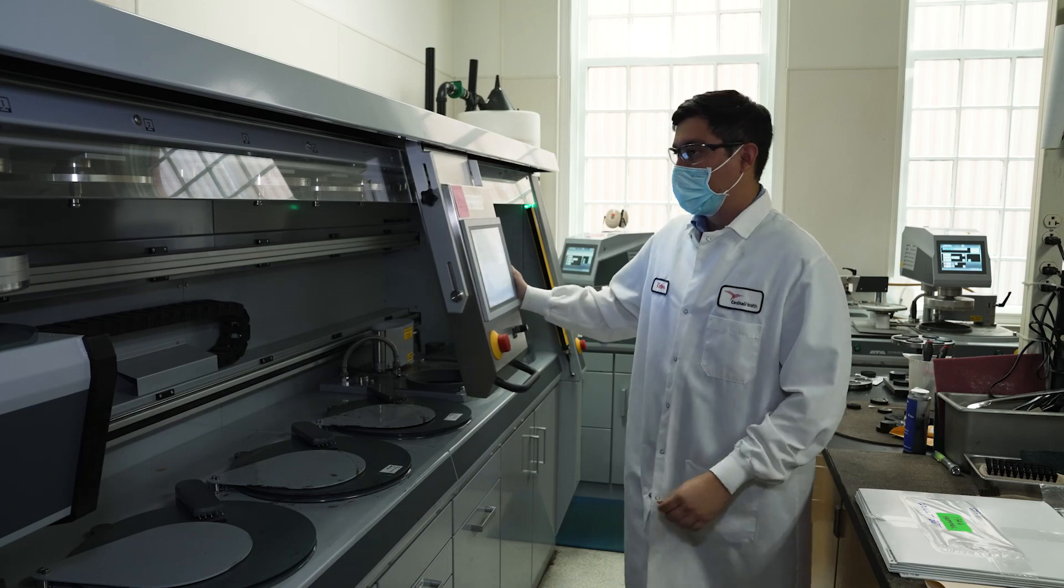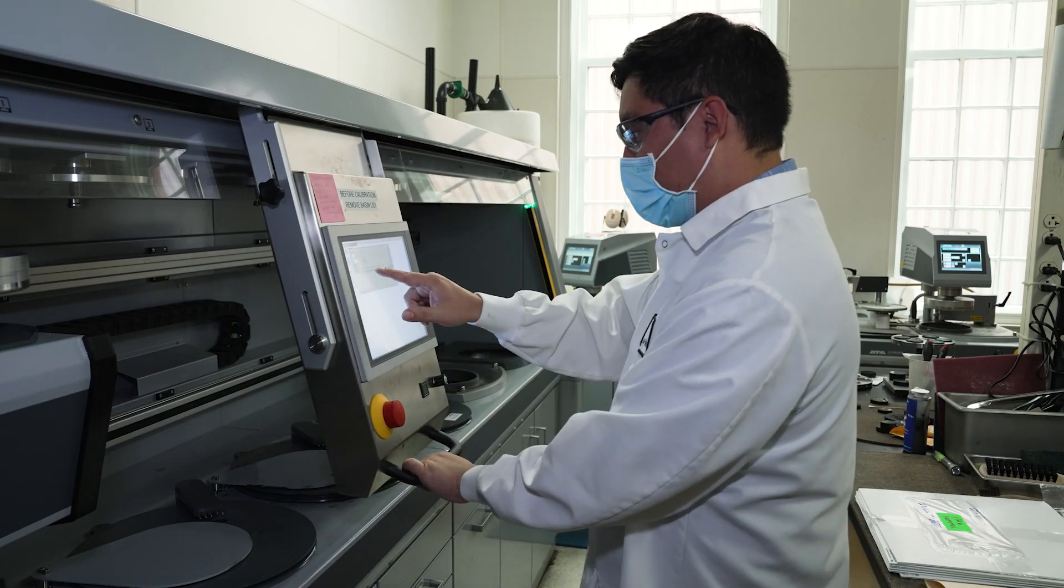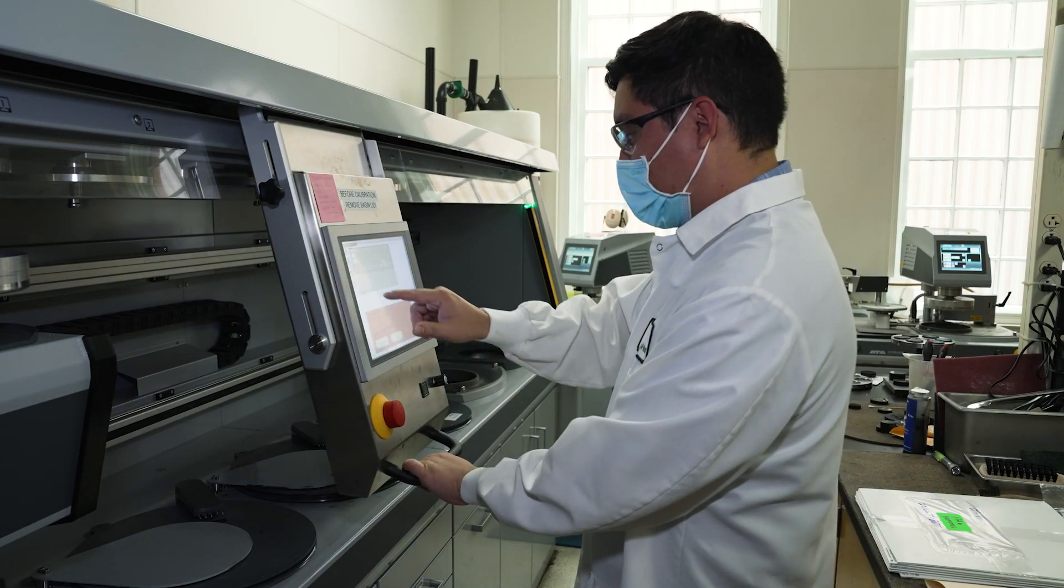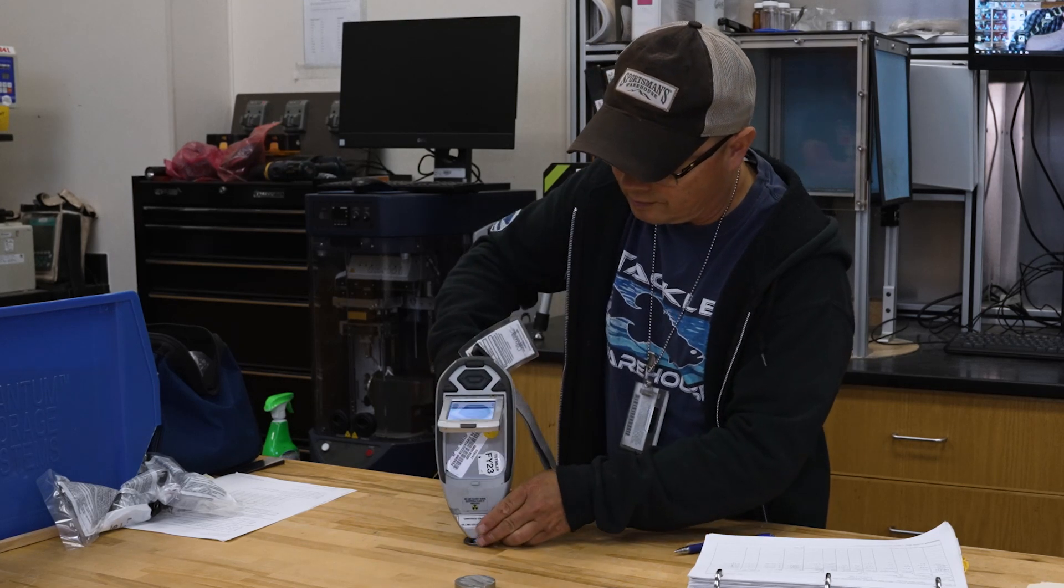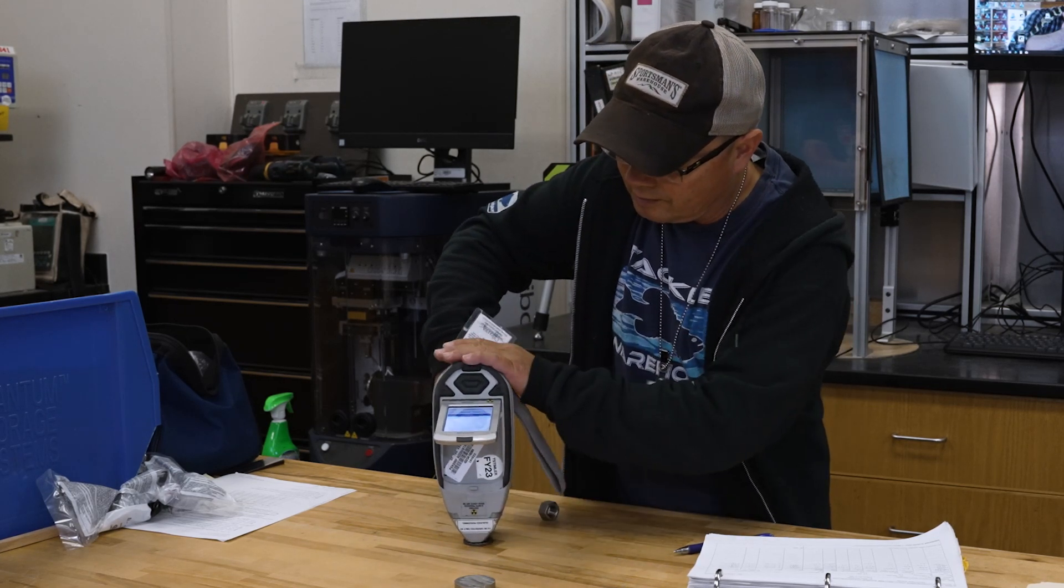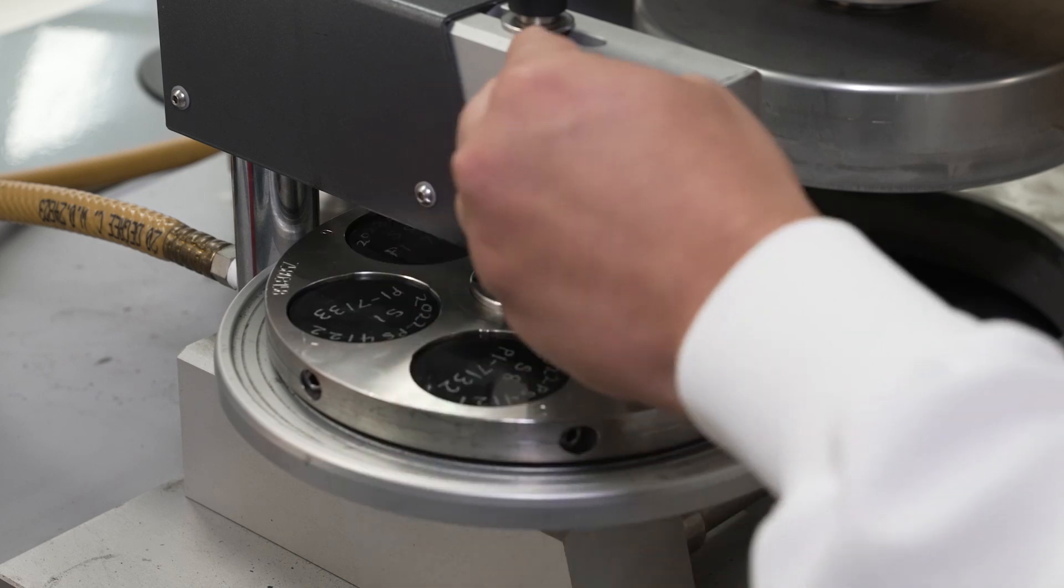Code 134.6 performs a variety of physical properties testing within the field of metallurgy. This branch is also responsible for the Shipyard Alloy Identity Program and Metallographic Inspection of Welds.